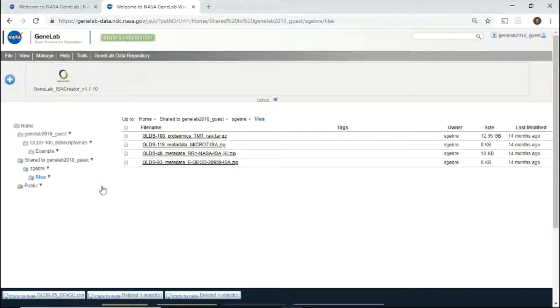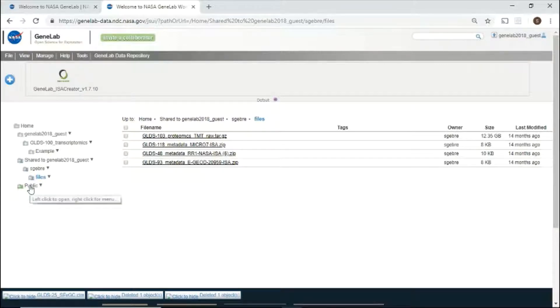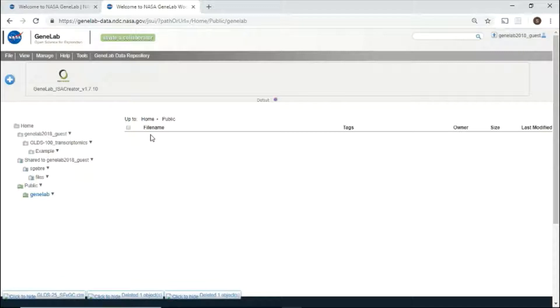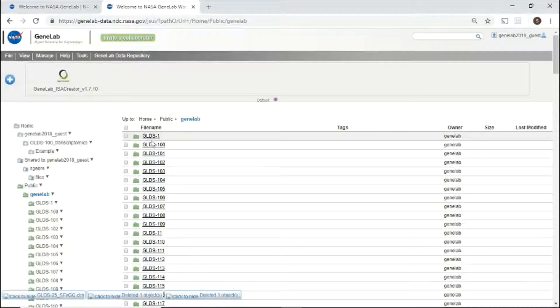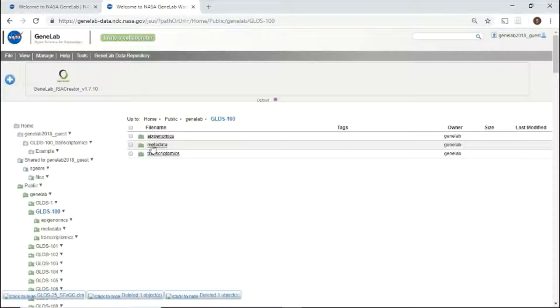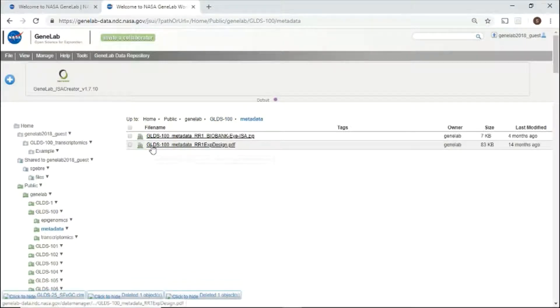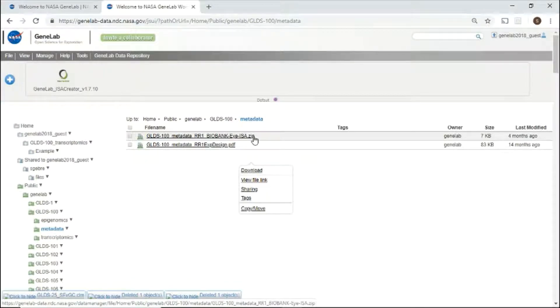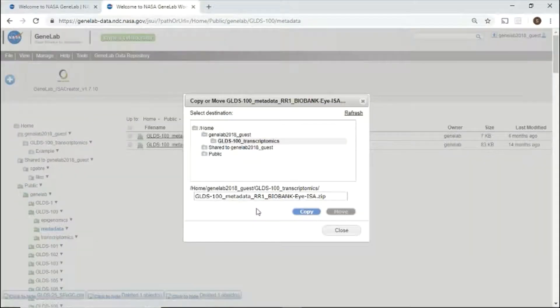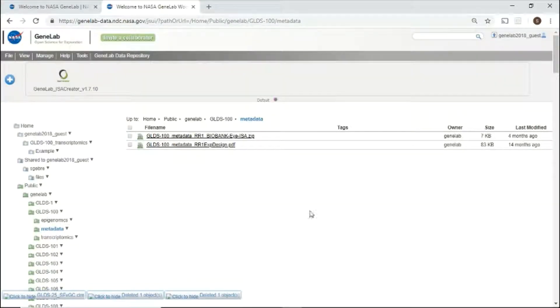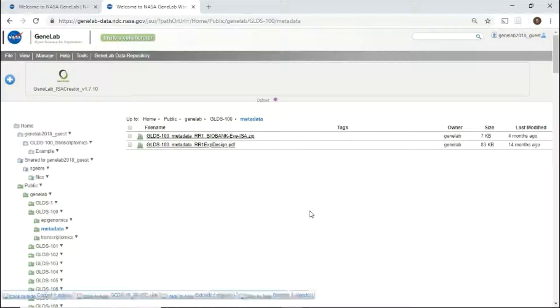To explore the data repository, click the public directory, then GeneLab. Once you have selected study of interest, you can download files or copy files to your private directory. To copy files to your workspace, use the right-click menu, select copy move, select the folder, then click copy. That file has now been copied to your selected folder.